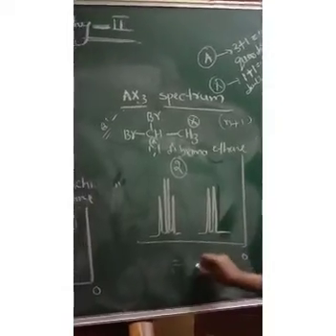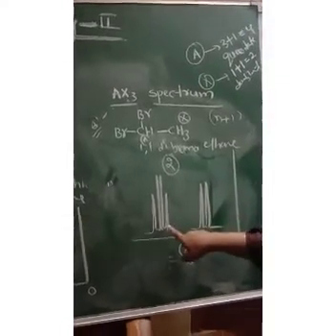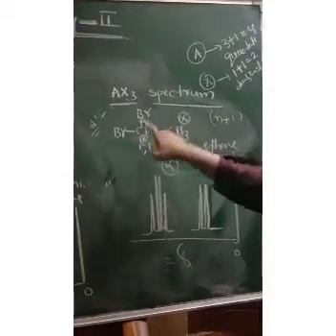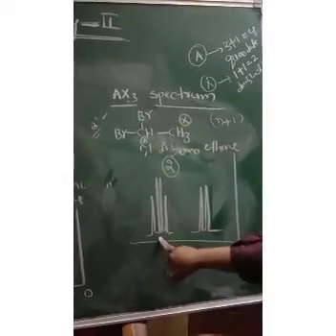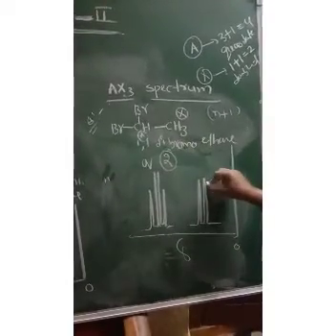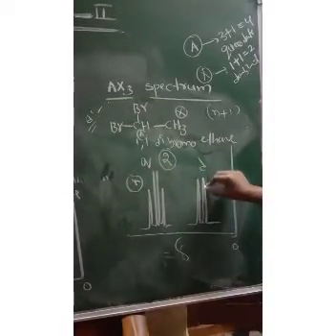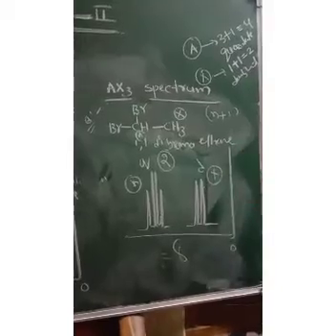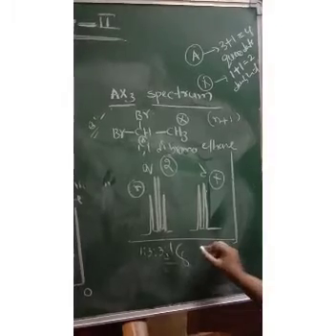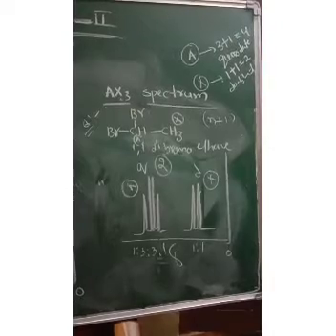So in the spectrum, the chemical shift value of the quartet is higher than the doublet, because the quartet signal is for the A type of carbon having 2 highly electronegative atoms. That's why the quartet has the highest chemical shift value and then the doublet. This is the quartet signal and this is the doublet signal. Quartet signal for A type of protons and doublet signal for X type of protons. The quartet has a 1:3:3:1 intensity ratio and the doublet a 1:1 intensity ratio.